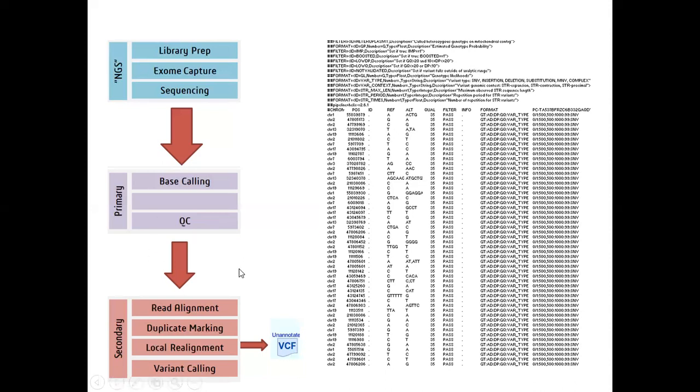As I mentioned, it evaluates your data on different parameters, and we will look at those parameters also. Once the QC is done, the first step is read alignment. Variant interpretation and correlation with phenotypes is generally used in humans, and most of the time in clinical settings. Though it is for research also, most of the time it is for patient care. So it is very important to take care of all these parameters, and when we set the parameters, they need to be very stringent.